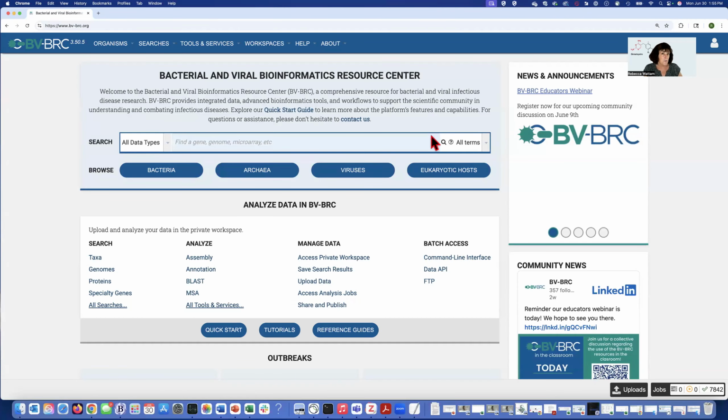So hopefully you've all watched the introductory video that talks about the variation service and the SNP callers and the aligners. Let's submit a job. As an example, we're going to use some data from that large megaplate example that we talked about in the introduction. All those samples are very closely related. It's E. coli evolving in real time to antibiotic pressure. So that's going to impact some of the choices.